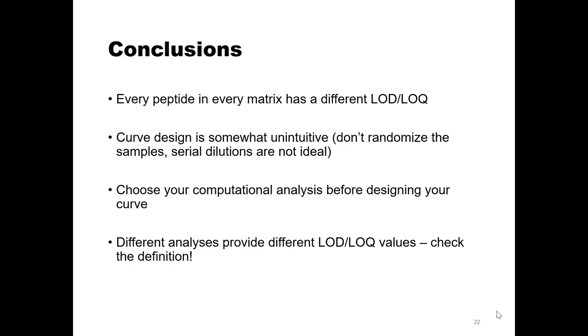Yeah. So how often do you run a calibration curve? You run it every day. If you're using a calibration curve, if you're in the ratio, if you're just using this kind of standard dilution experiment, you might only have to do it once. But then it's great, it's just that you have a sample. It's just a matter of doing it every day.